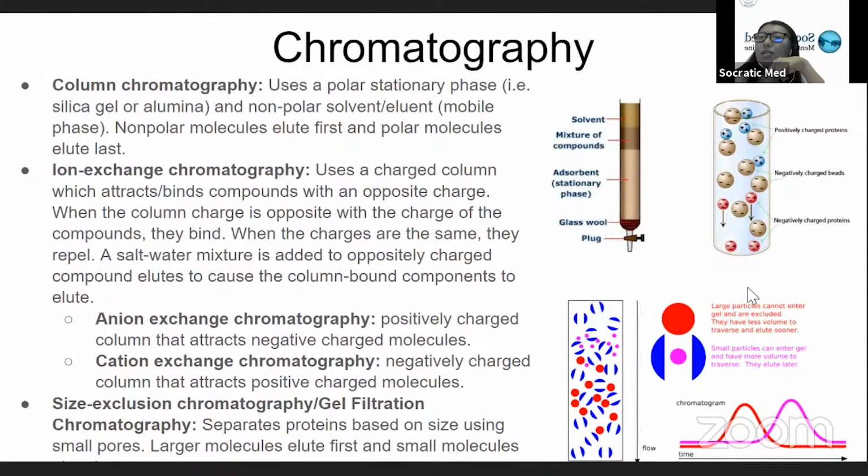And so researchers would collect that first, and then they would put that salt water mixture through to take out the ones that were reacting to the charged column, to get that other part of the compound that you're putting in the column.